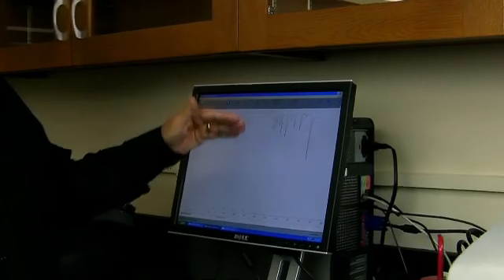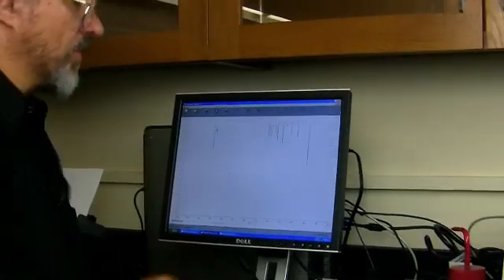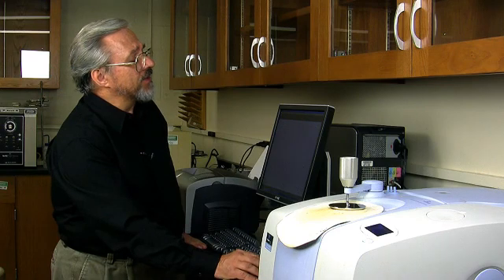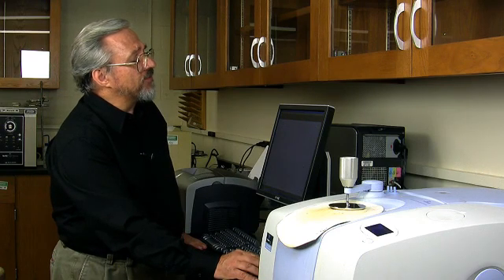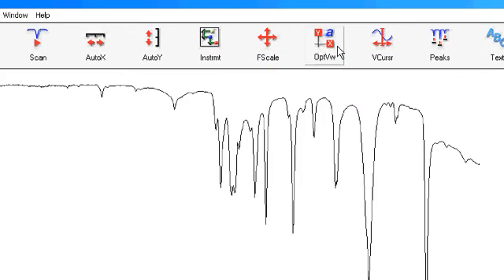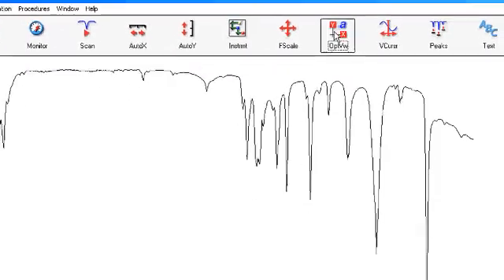The intensities of these peaks are not optimum. So what we do then is to go to the icon at the top called Opt View. This stands for Optimize the View. And we're going to click on it.